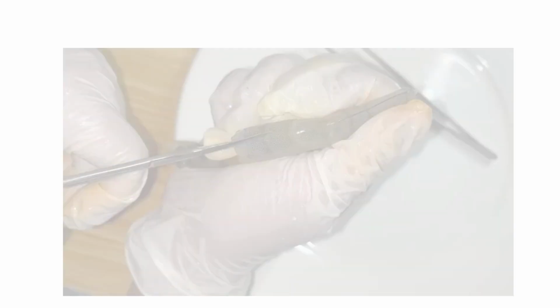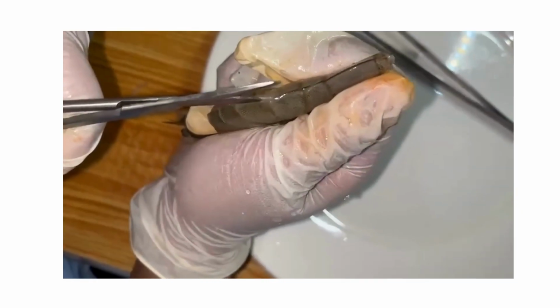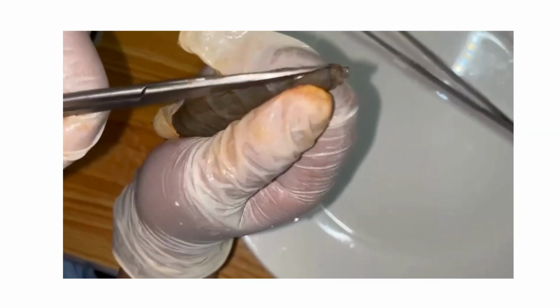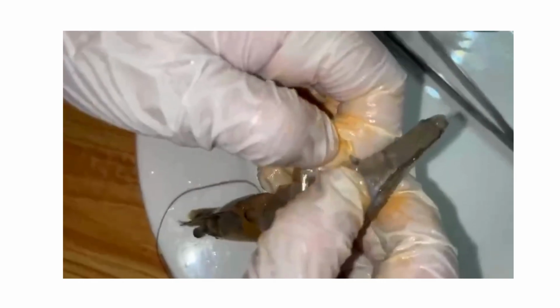Next is the dissection of the intestine. A careful incision is made along the dorsal side of the abdomen to expose the internal structures. Once removed, the intestine can be observed for its contents, structural integrity, or any signs of parasitic infection. This procedure is commonly used in studies of shrimp health, feeding habits, or disease presence.